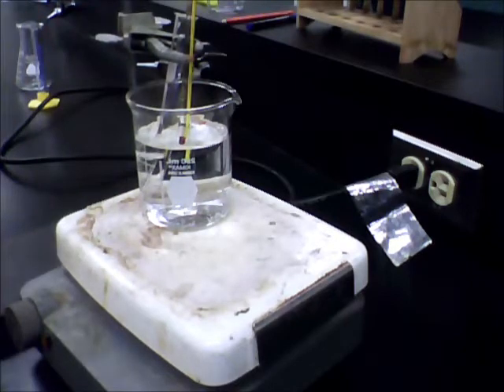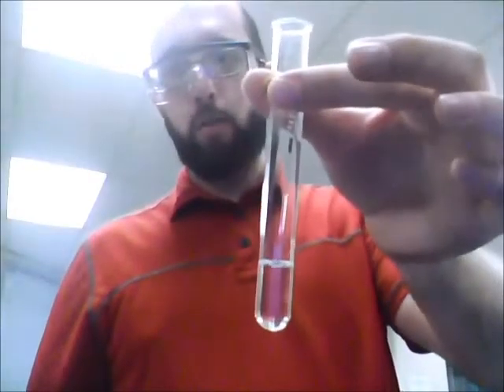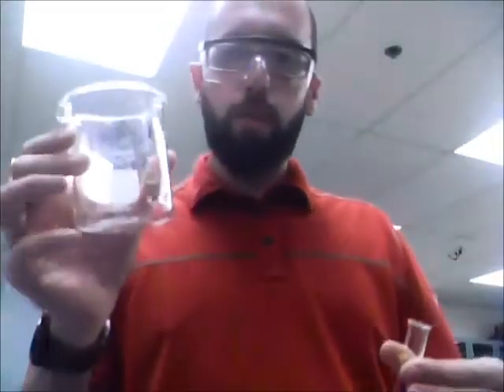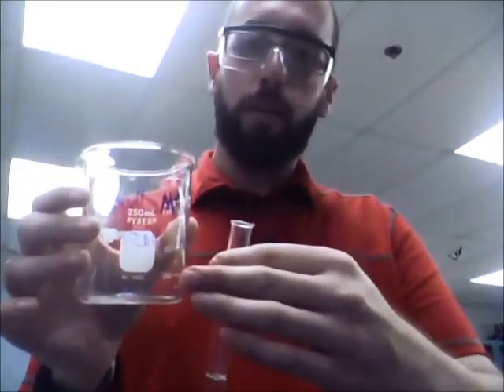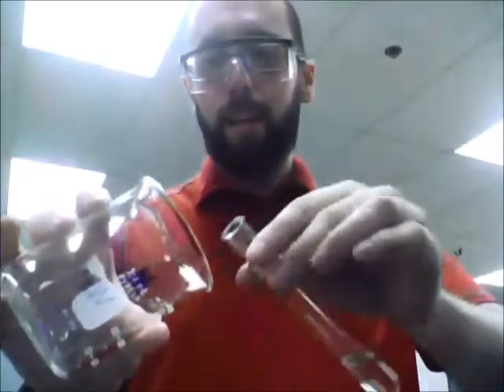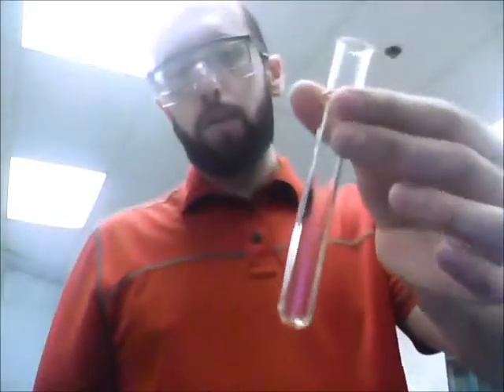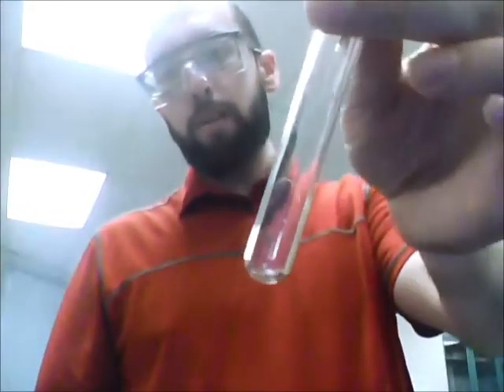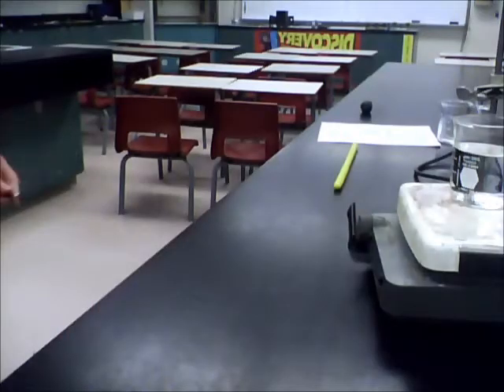Once you're done, dispose of your chemicals as instructed by your teacher. When you guys are finished with the alcohol, make sure this thing is cool before you touch it, otherwise it's going to burn your fingers. Afterwards, you need to go to the fume hood at the back of the class and find the appropriate waste beaker. In this case, we have methanol which is the one we're using in the previous experiment. We're going to ever so slightly dump the contents into the beaker. Be careful you don't drop the capillary tube because that's going to smash as soon as it hits the glass.